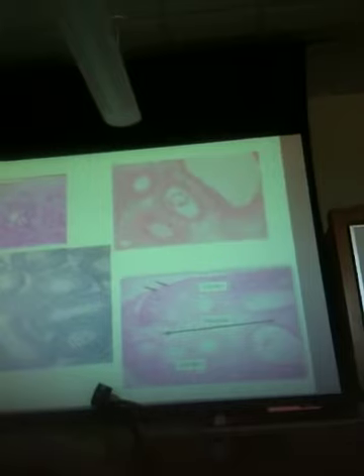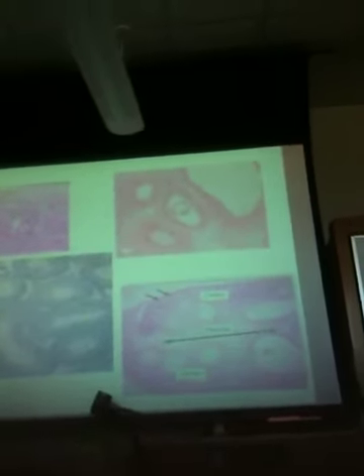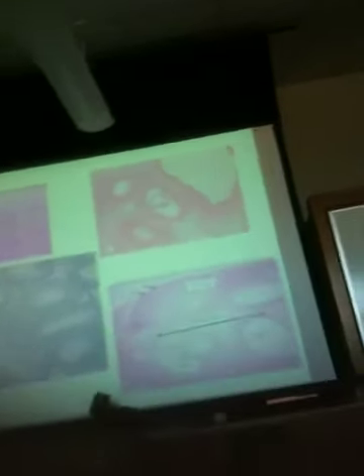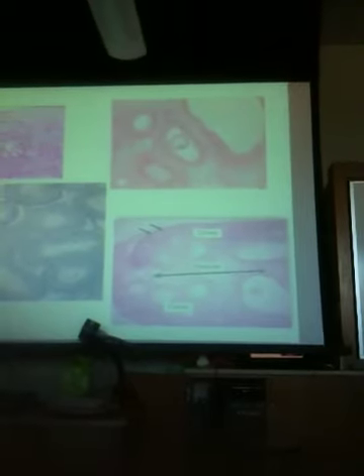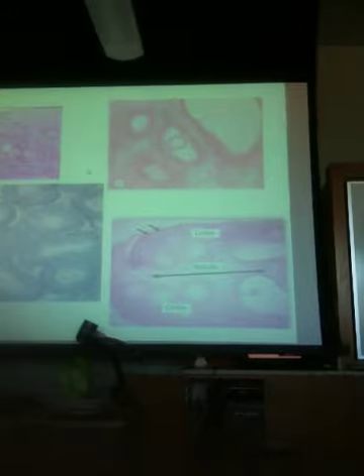What stage is that egg? It's not an ovum yet. You don't get an ovum until it meets a sperm. What stage is released from a Graafian follicle during ovulation? Okay, I'm going to leave you with that question. You need to look at that.